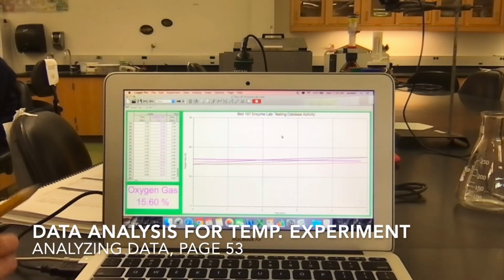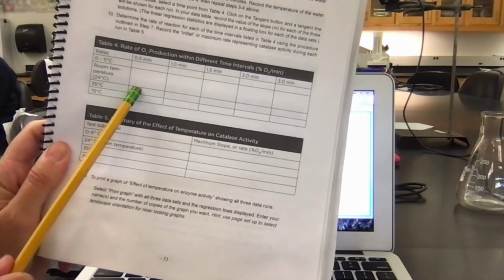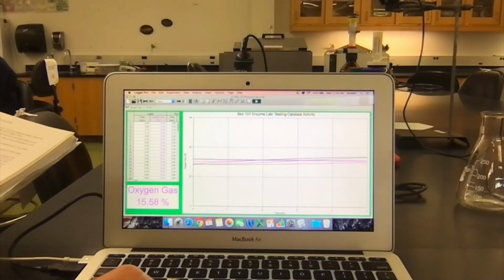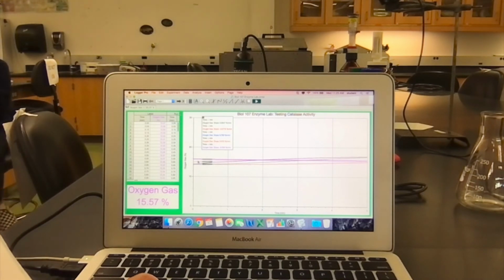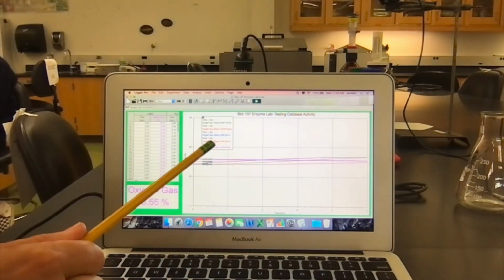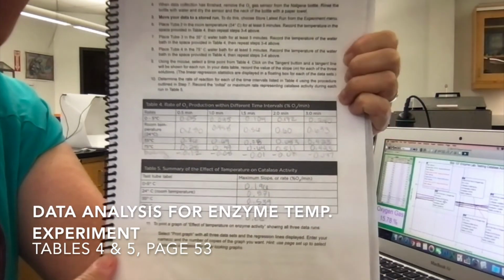What I have to do next is help you fill in these tables on page 53, the slopes at the different time intervals. So I'm going to do that. Again, what you want to do is go find that tangent line. I think this is it, right? Click on it and fill in the tangent or the slope at half a minute, 1 minute, 1.5, 2, and 3. And then I'll get the maximum slope. I'll fill this all in using this data, and I'll show you what it says. So here's the data for the table.